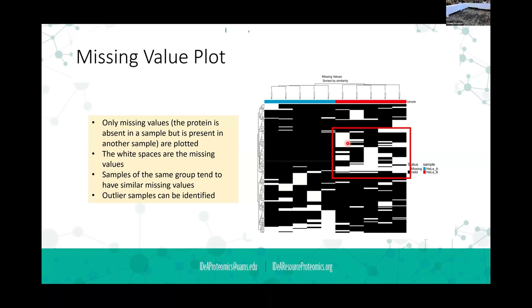So I blame Kyle. Mike had a comment too. Oh, I just pointed out that some integral membrane proteins and some of the small mitochondrial proteins have similar problems, that when you digest them with trypsin, they just don't make very many good LCMS friendly peptides. So they can just be effectively invisible to the experiment.